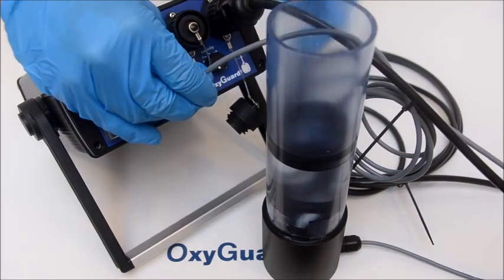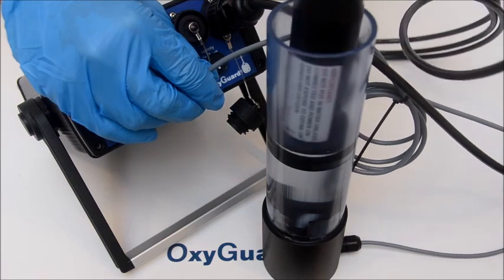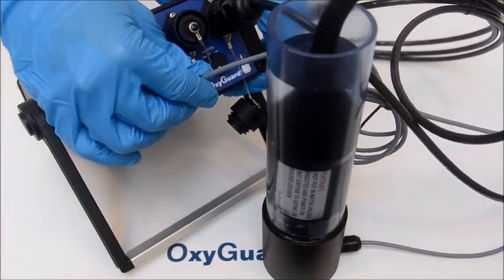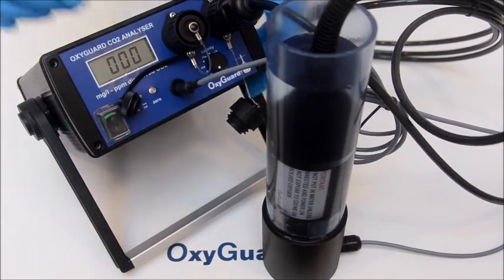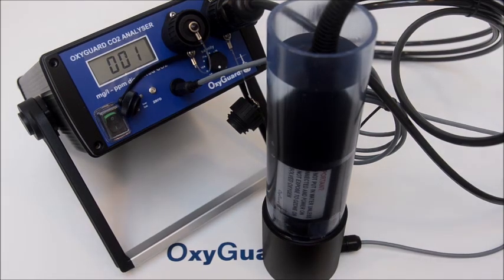Stop the stirrer, place the probe in the beaker, and start the stirrer again. When the reading is stable after about 5 minutes, check the reading. If it's less than 20 mg per liter, the water is approved for use. Empty the beaker and rinse it with some distilled water.